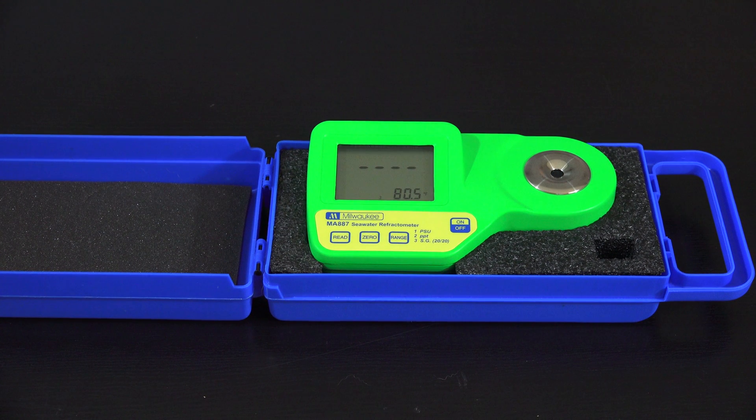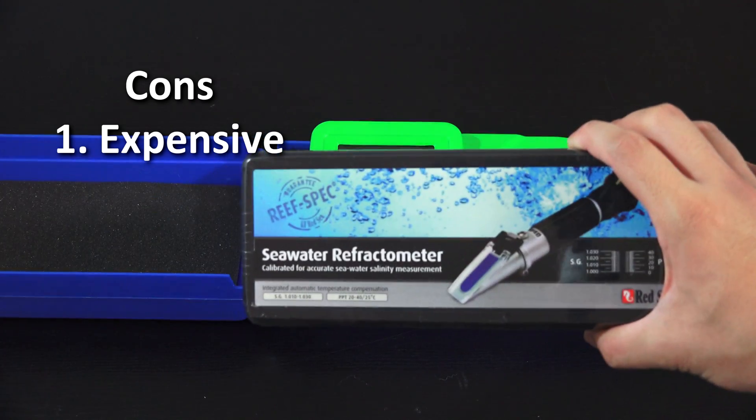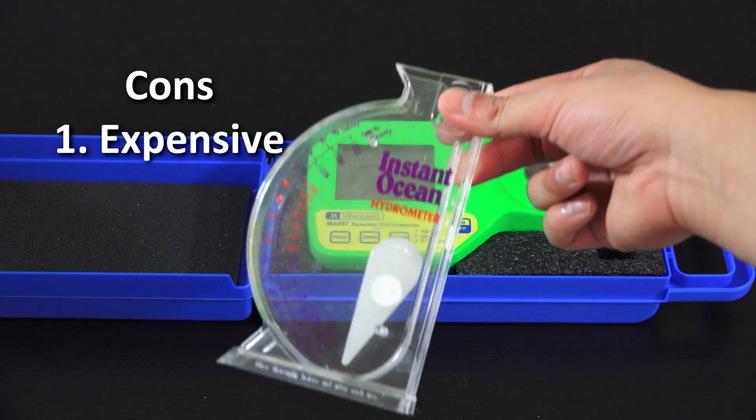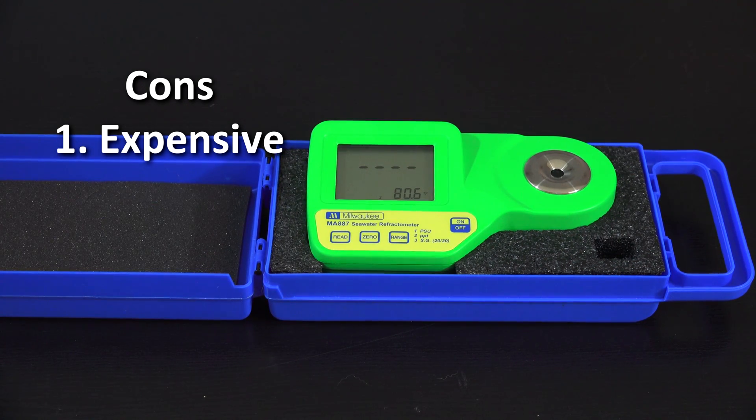The first con is that it's expensive — it's about $100 for this unit versus $50 for a mid-range option or $10 for a cheaper analog version.